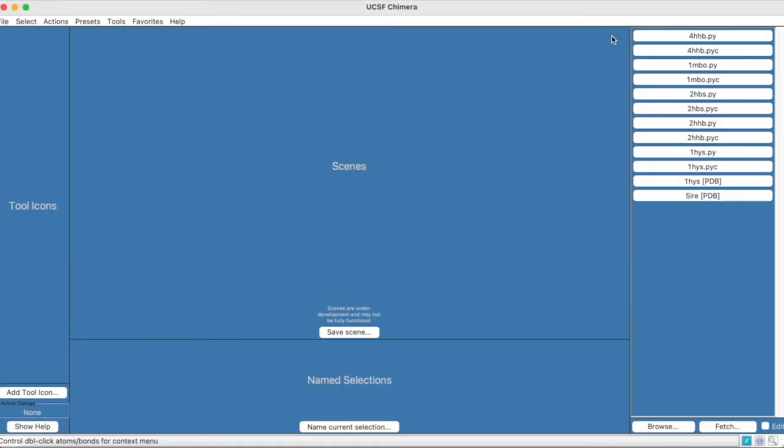For this workaround, it is key that you are working within a session file that has previously been saved using save as. Chimera's file directory makes it easy to identify such files. In this list, files marked with an extension have been saved beforehand, while those without an extension have not. With that knowledge, let's open the hemoglobin structure we have been looking at.